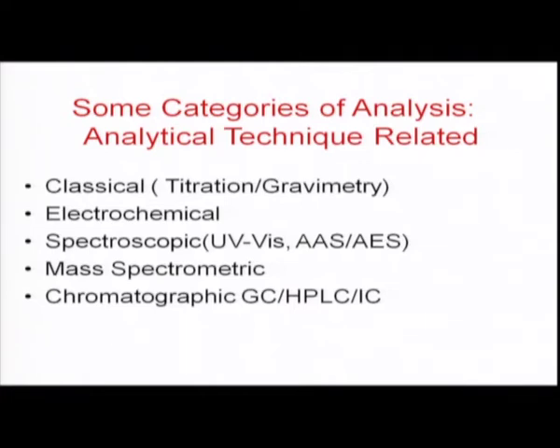So, the water sample should be collected properly. If required, it should be refrigerated, stored properly with the appropriate preservation, and then brought to the laboratory for the detailed analysis. Because we have a wide variety of parameters, we have to test for physical parameters, chemical parameters, biological parameters, all those things. So, it is very important that the water sample is collected with the utmost care and then brought to the laboratory to get very reliable, representative data of the particular sample.